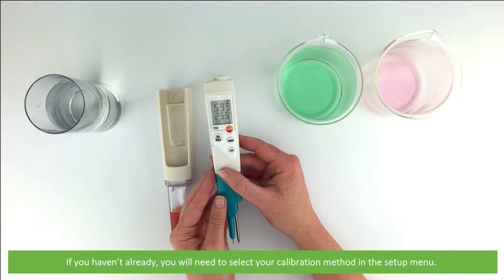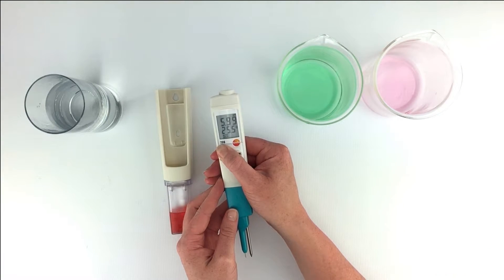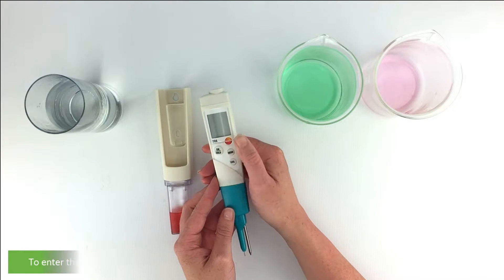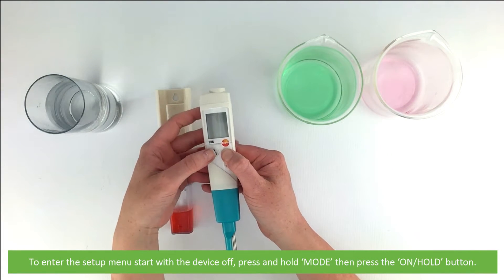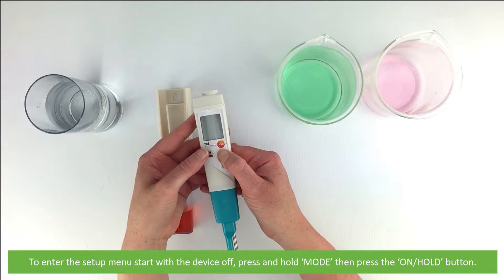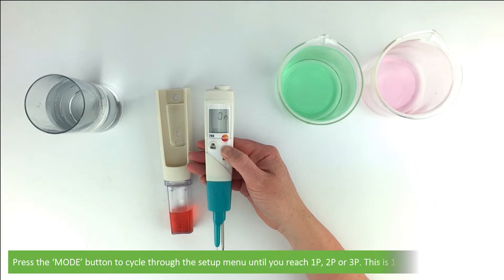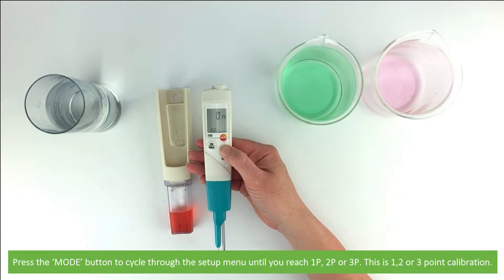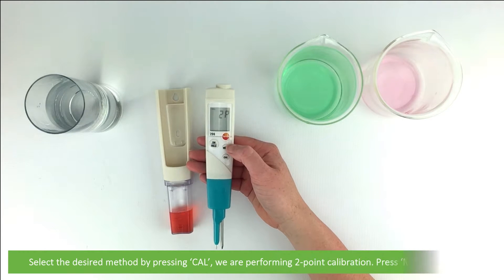If you haven't already, you will need to select your calibration method in the setup menu. To enter the setup menu, start with the device off, then press and hold mode, then press the on/hold button. Press the mode button to cycle through the setup menu until you reach 1p, 2p, or 3p — this is one, two, or three point calibration. Press cal until you select the desired method.